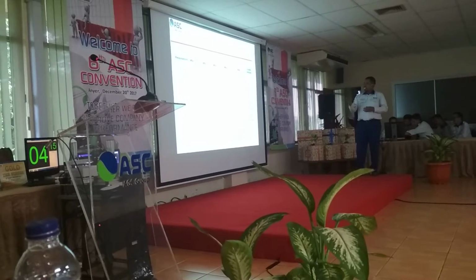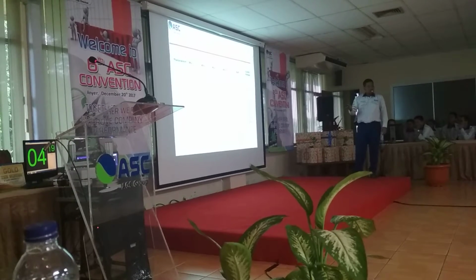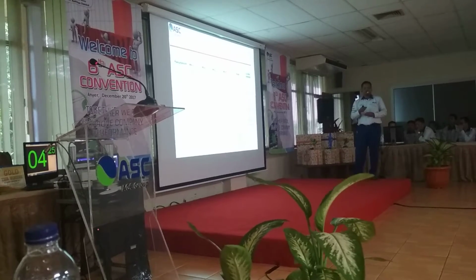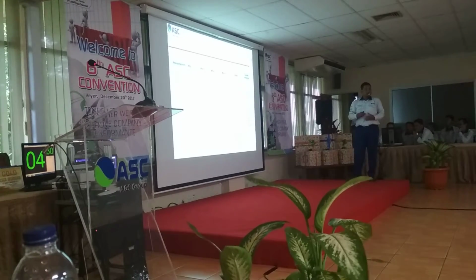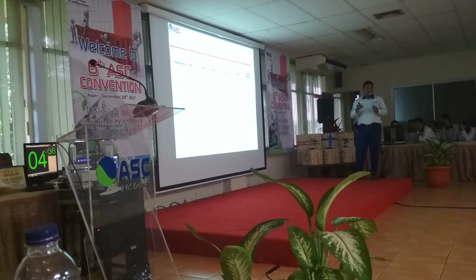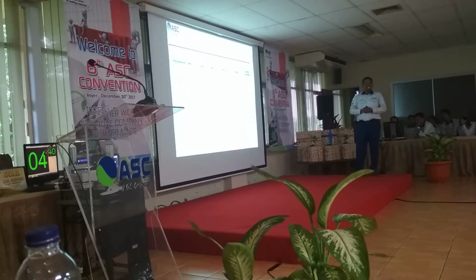Let's take a look why we need to improve. Because there is a fault in identifying the fish eye, using the eye, with variation in the age of the operators. And the important thing, there is no tool available on the market at laboratory scale that can count fish eyes automatically.